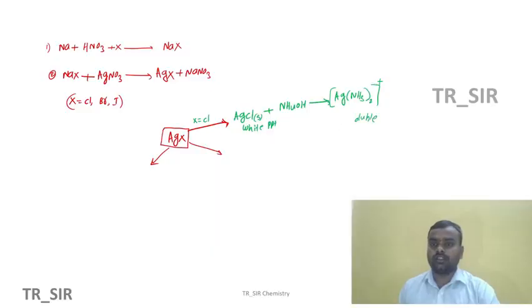That confirms that chlorine is present in the given silver halide.